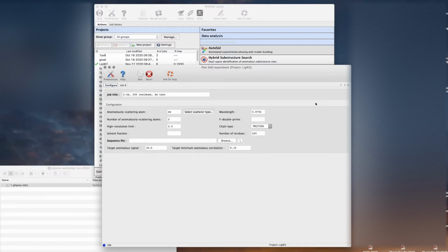And soaking, of course, depends on the atom. So some things that you soak, you kind of know how many might be. So for example, if you soak in a mercury that's going to bind specifically to sulfurs, then you know how many cysteines you have, and you can guess how many might be free cysteines, not in a disulfide, and that's going to be kind of the number you're going to be going for. So it depends on the atom type.